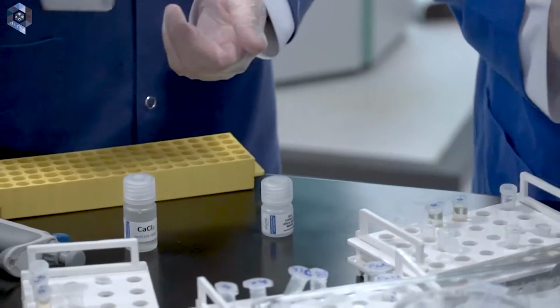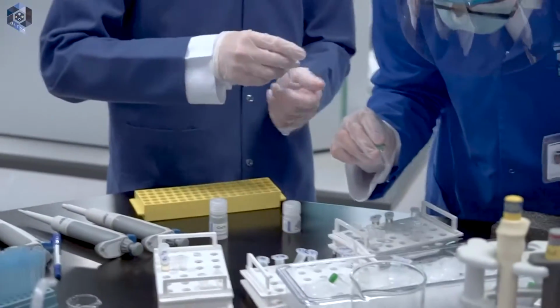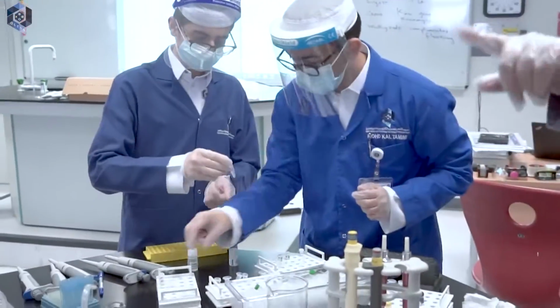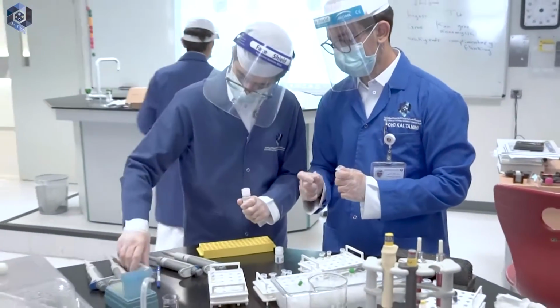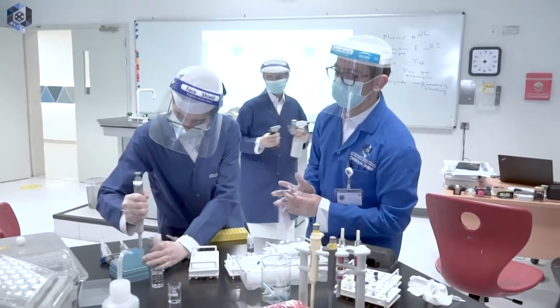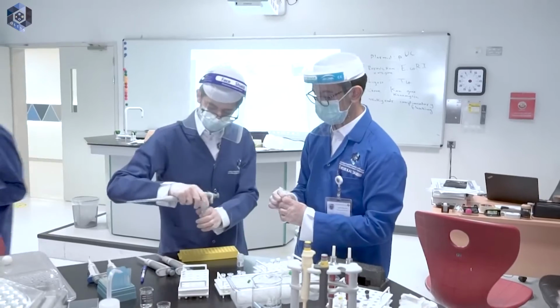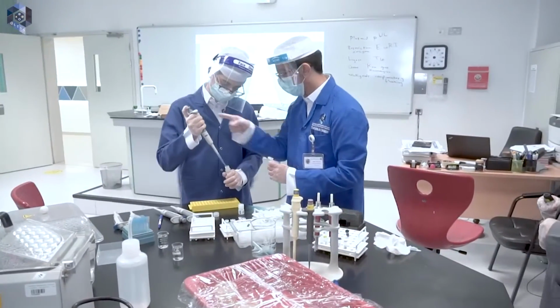Now the next step, who was asking about the sterile conditions? You? Now go and prepare the sterile conditions there. We will continue working on that bench, the next step. And clear it please from any papers, clear the bench there. No papers, no pencil case, nothing there should be. Now, Mary, help him with the sterile conditions there.